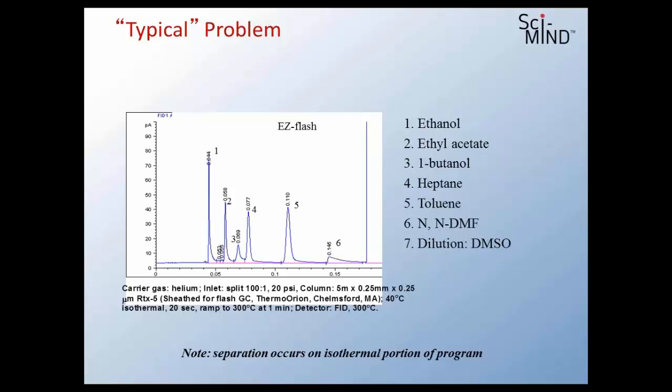And here we can see 6 compounds that are separated in the space of about 9 seconds. And this was actually inside a traditional gas chromatograph with this special column device in there. But anyway, that's sort of optimized for speed. Not as easy to run.